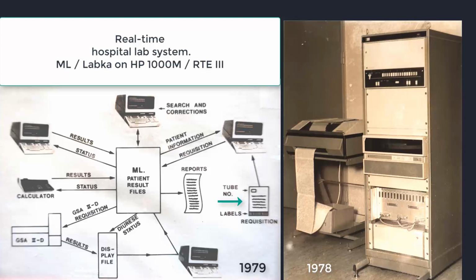Note the sample form with labels, which were used to mark the sample tube containing the sample material to be examined. I will return to that later. The storage space for the analyzed results was limited to approximately 20,000, equal to a time period of approximately 1 month. There was no big database.